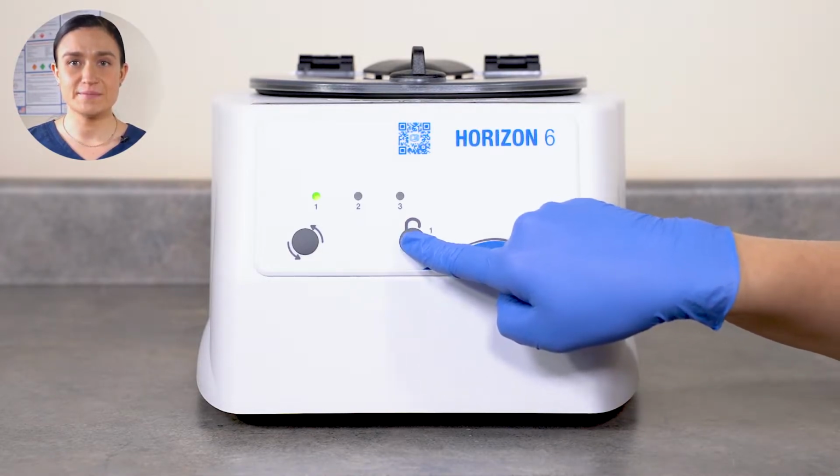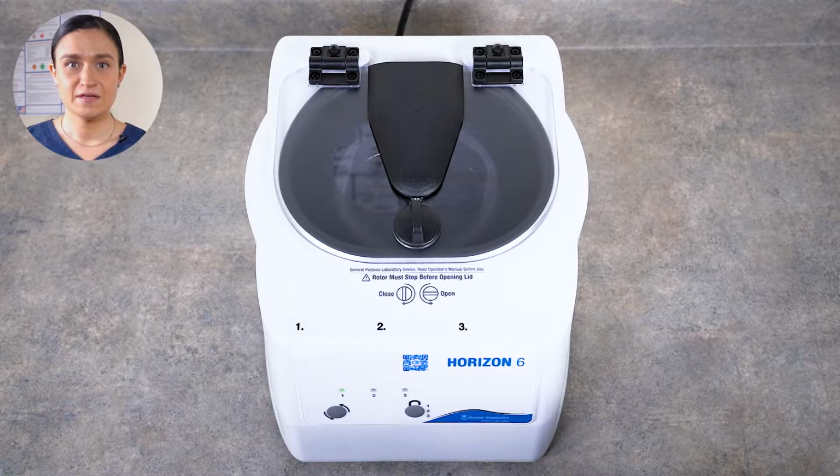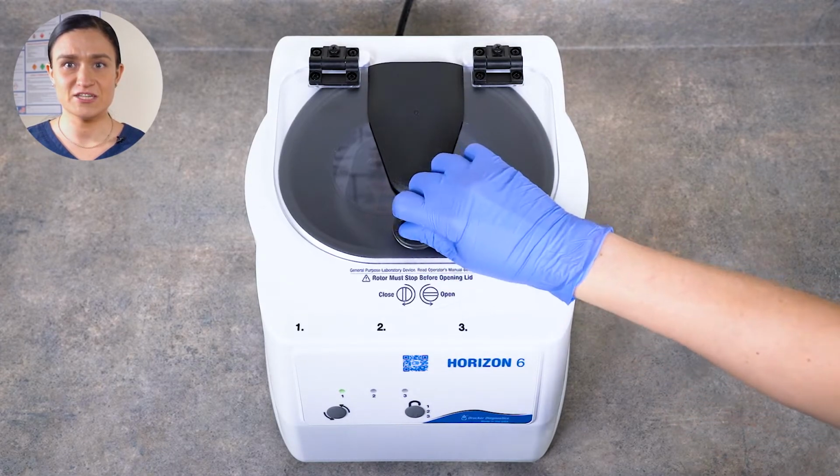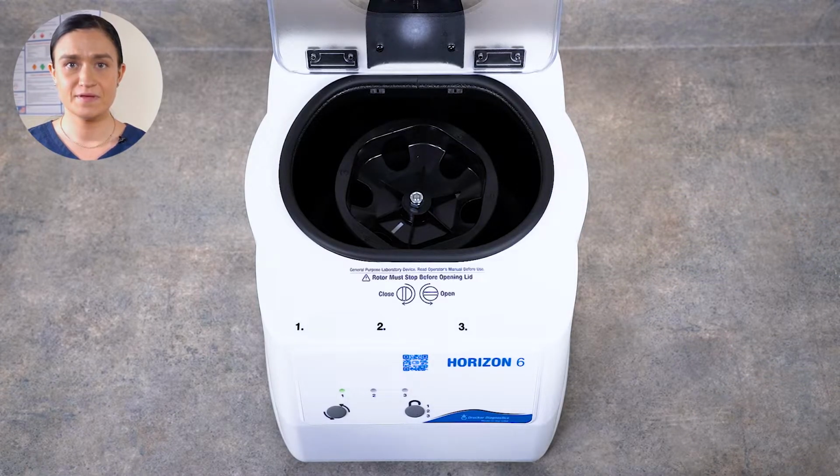If you'd like a more in-depth overview of these controls, a link to a full overview video is on your screen now. Now we can twist our lid latch and lift the lid open. You can see the rotor here inside. Your Horizon 6 comes with its rotor installed and ready to run. All we need to do is place our tube holders.